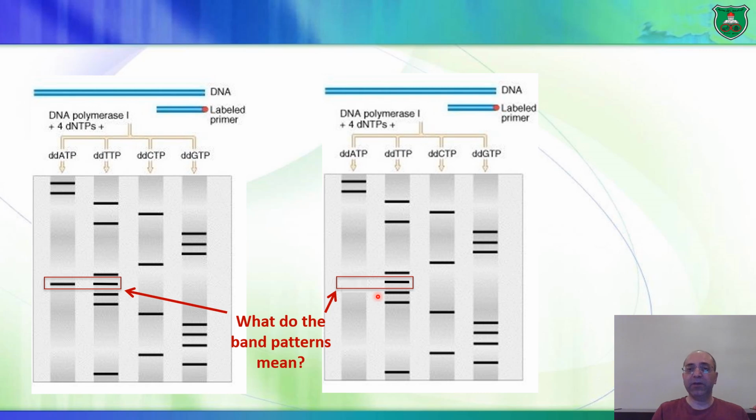And that's how it is. And then we have to study if this genetic variant or if this mutation is pathogenic or not. So in this case right here, the individual is heterozygous, or let's say a carrier. It depends on the change, if it is a polymorphism or a mutation. This person right here is homozygous.